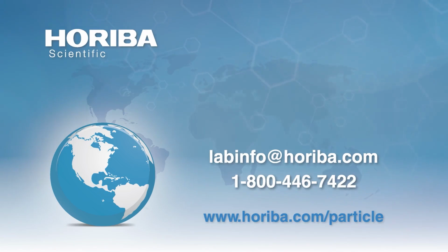Thank you. How does this technique compare to others, such as laser diffraction? Well, basically you're making measurements using different scientific principles, so to speak. So you're going to expect to get reasonably similar data, but you might pick up some smaller ones with this than you could see with laser light scattering, for example. You might have a problem if you had some large ones, that you would again miss them. So you would expect similar data, but it's not something where you would hold it up to the light and they would superimpose on each other. They'll be similar, but not identical.